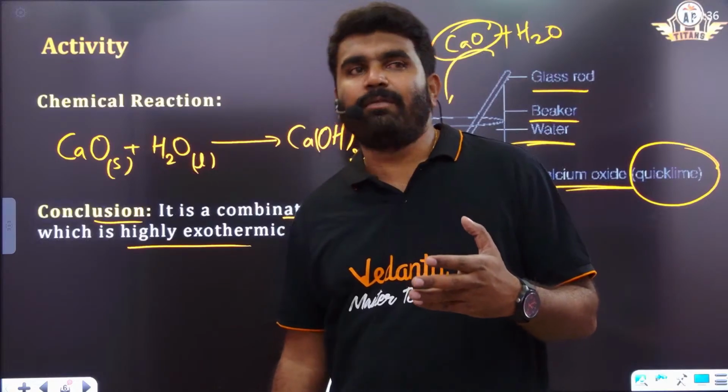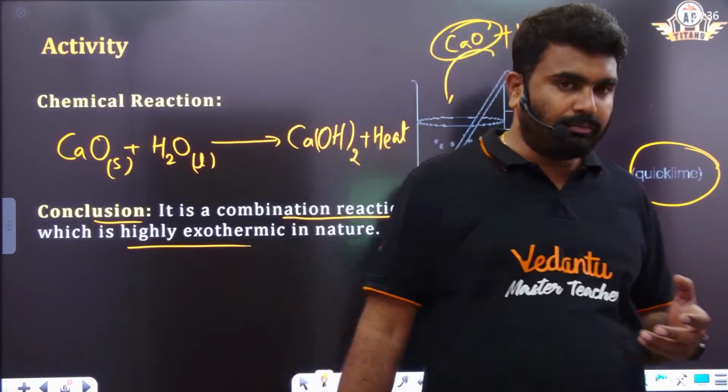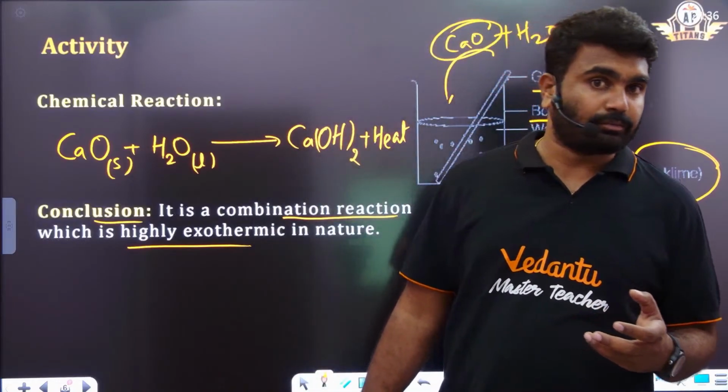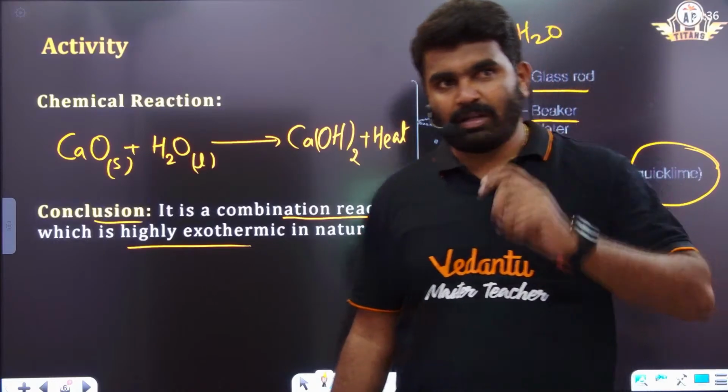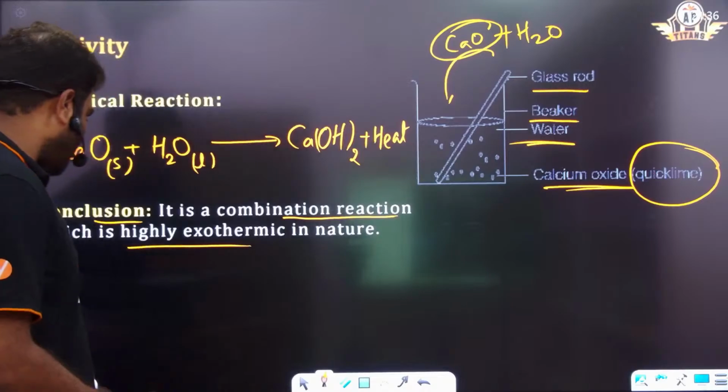If we touch the beaker, we may get to know the temperature. So this is the second activity.